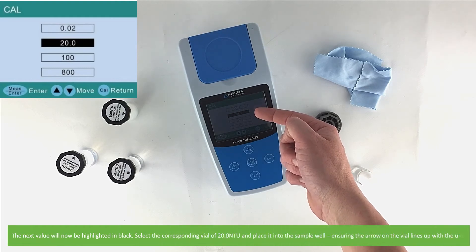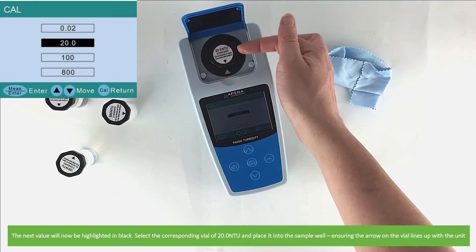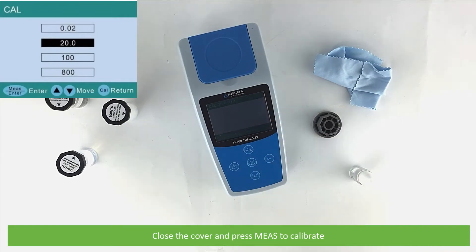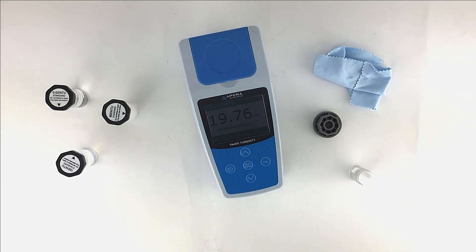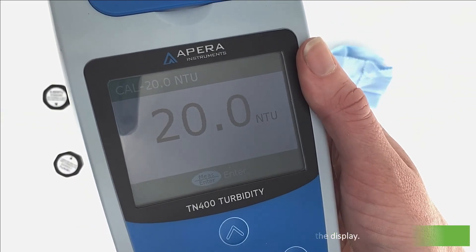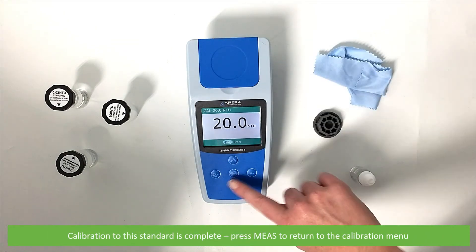The next value will now be highlighted in black. Select the corresponding vial of 20 NTU and place into the sample well, ensuring the arrow on the vial lines up with the unit. Close the cover and press measure to calibrate. Wait as the unit calibrates to 20 NTU. When calibration is complete, 20 NTU will hold on the display. Calibration to this standard is now complete. Press measure to return to the calibration menu.